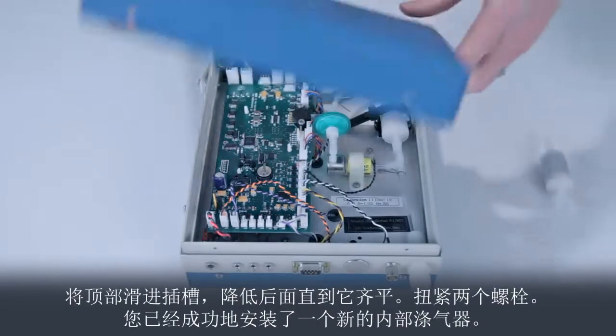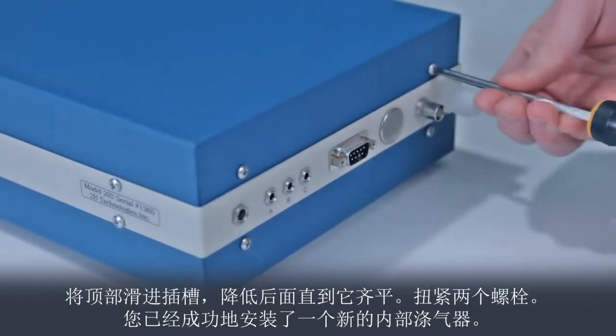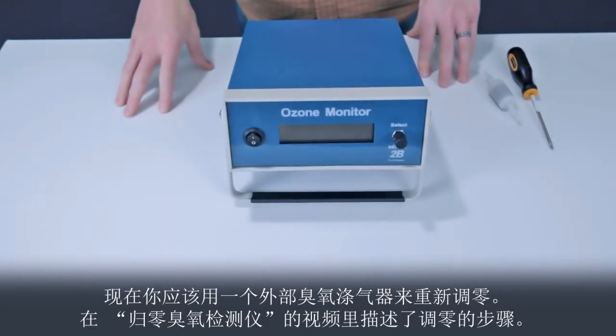That's it. Slide the top into the slot, lowering the back until it is flush, and replace the two bolts. You have successfully installed a new internal scrubber. Now, you should re-zero the instrument using an external ozone scrubber as described in the Zeroing the Ozone Monitor video.